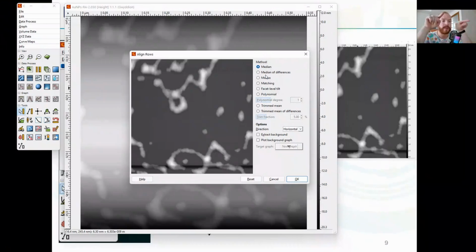So we calculate, for example, 2 or 3 rows, and then calculate a median one, and then place this median one in the middle. Then next 3 the same, next 3 the same, next 3 the same, and so on and so on.